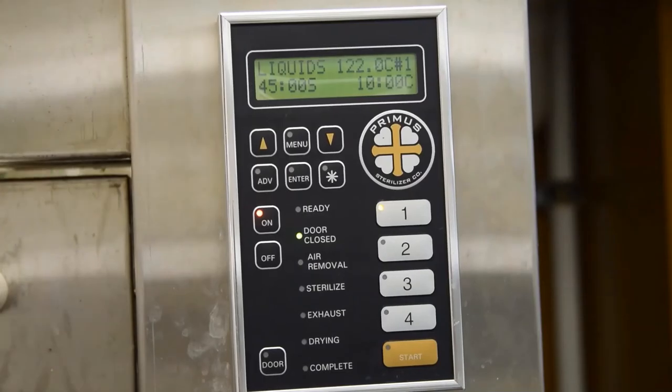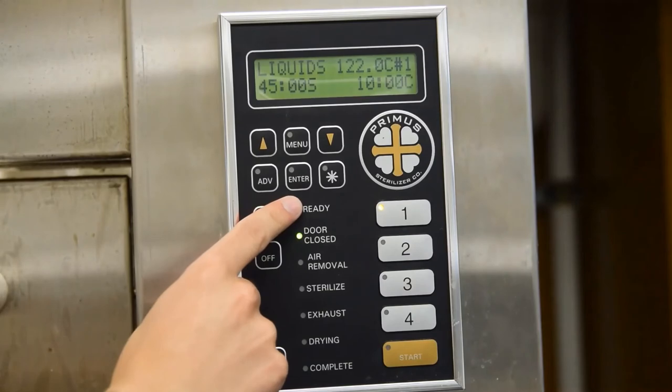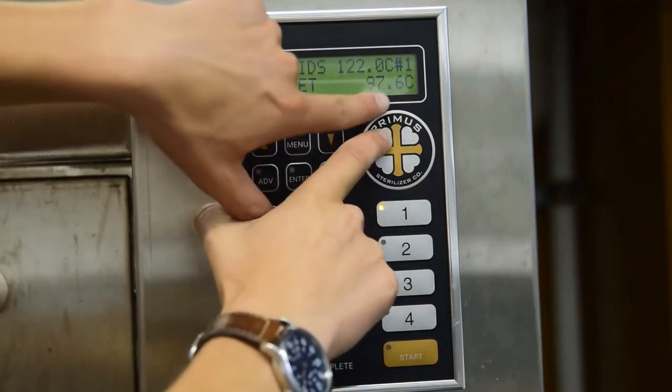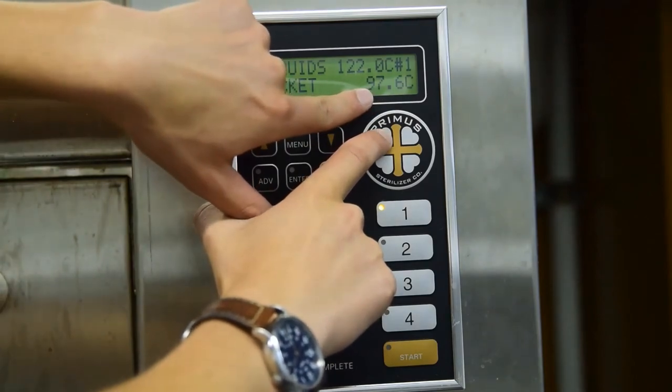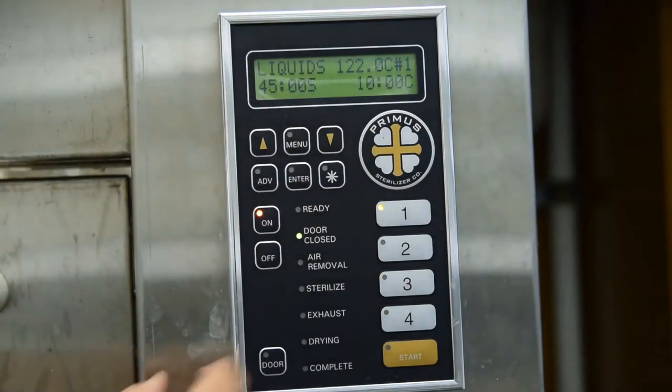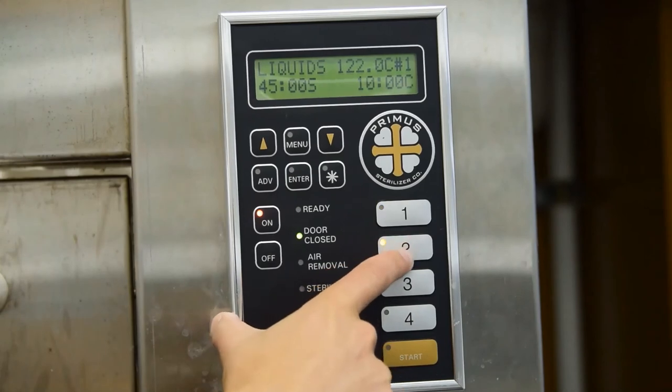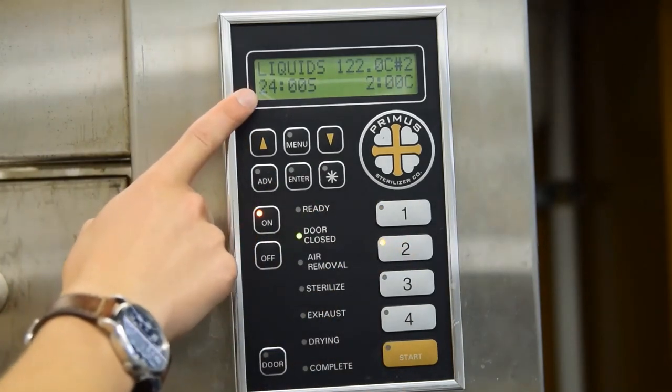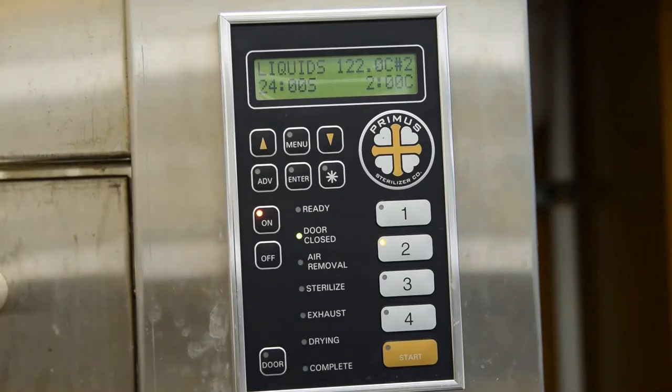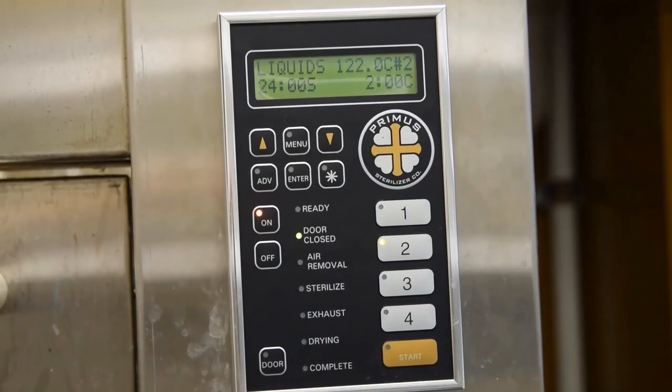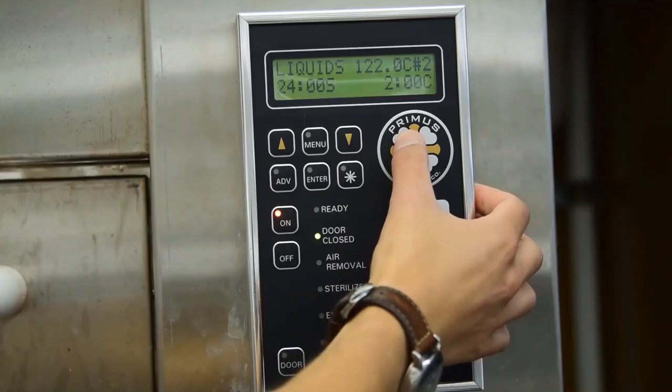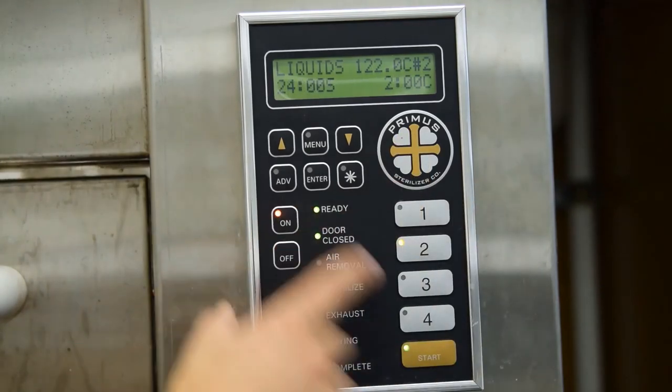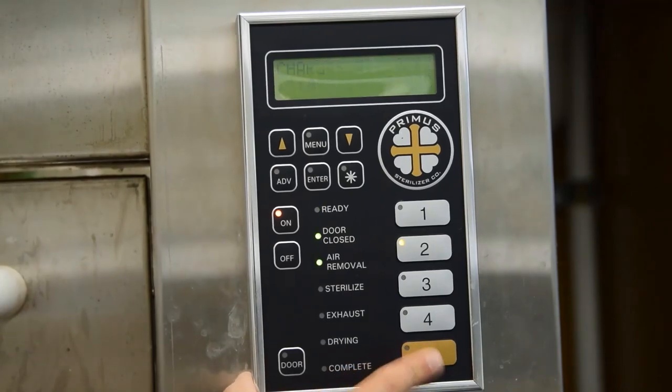Now we want to see which cycle we want to use. We're waiting for the ready button, which is not yet lit. The jacket temperature needs to reach about 116 degrees Celsius. It's currently at 97.6. So we're selecting cycle number two, which is 24-minute sterilization. This is okay to use for most media and liquids, but not biohazard-based. So now we need to wait for the temperature to go up. We're almost there. The ready light has come on and we can press the start button.